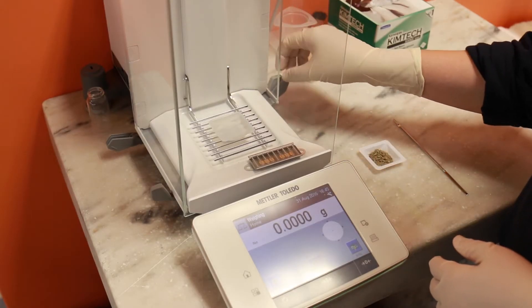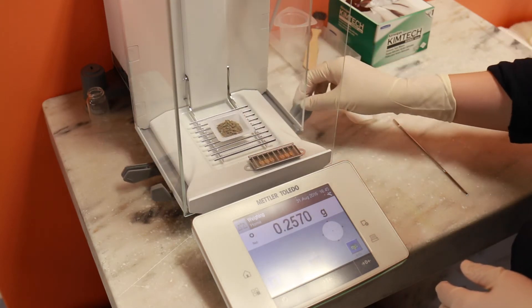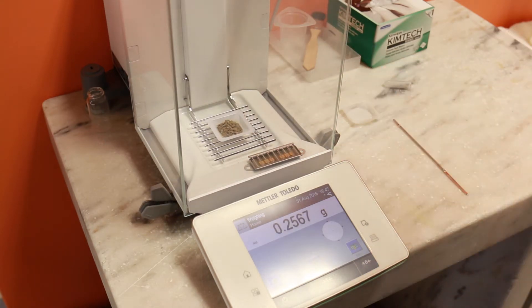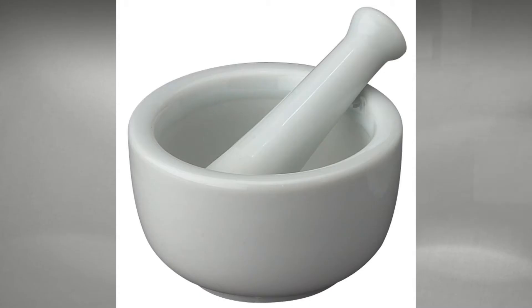You can determine if you have fully dried your sample by measuring the weight of the sample at the start of the drying process and during the process to completion. When the measured weight no longer decreases with further drying, you can be assured your sample is fully dried. Once dried, powder the sample by crushing or using a mortar and pestle, and remove any large particles such as grass if possible. This will improve the extraction efficiency.